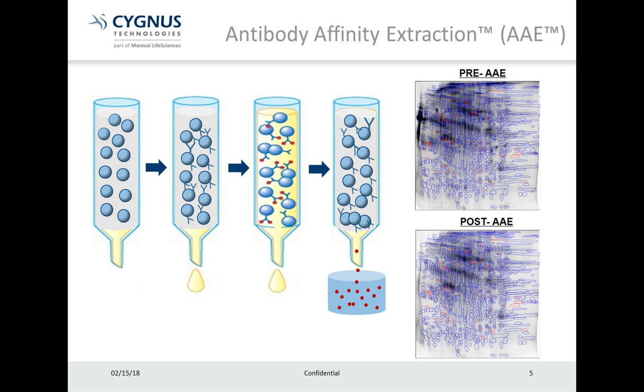And for the past few years, the most common detection method has been large format 2D silver stain. However, more recently, many companies are opting for mass spec detection for coverage analysis to avoid many of the limitations associated with gels.